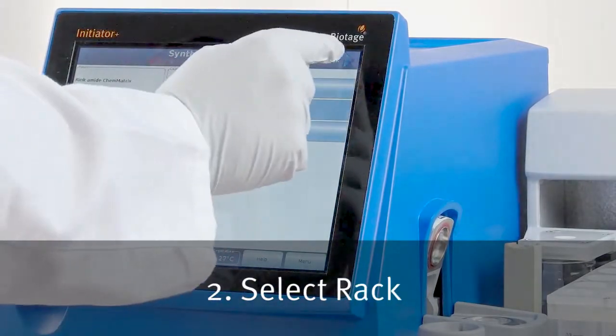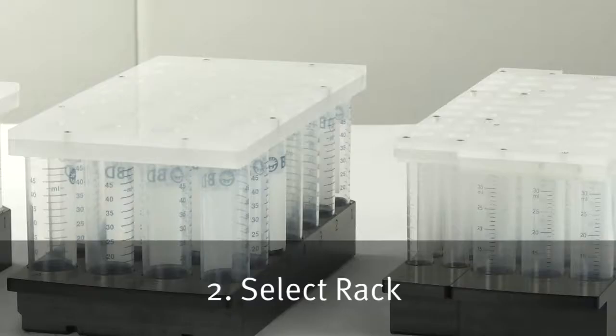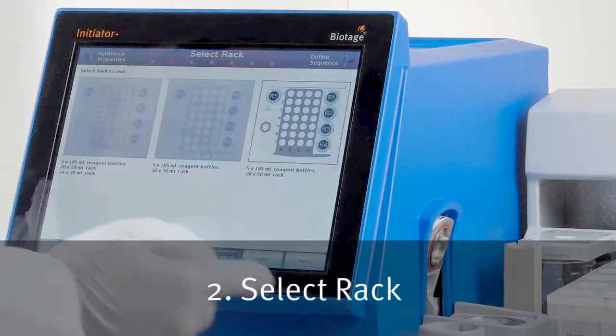Select the amino acid rack. Choose from the standard rack or the two available optional racks.